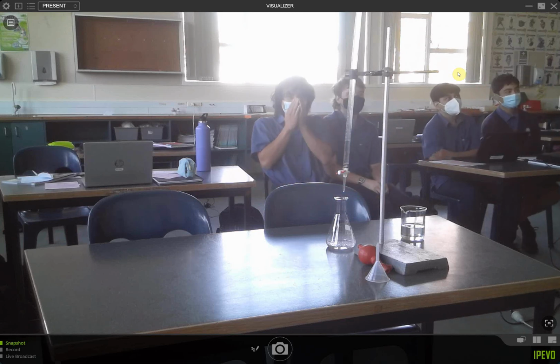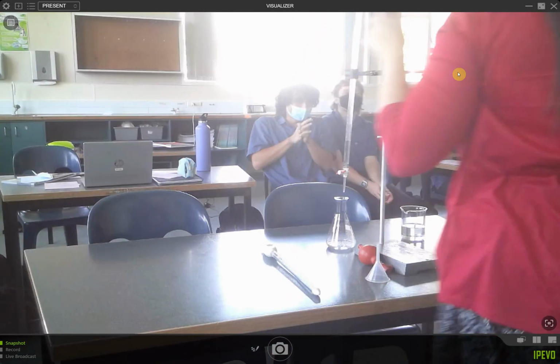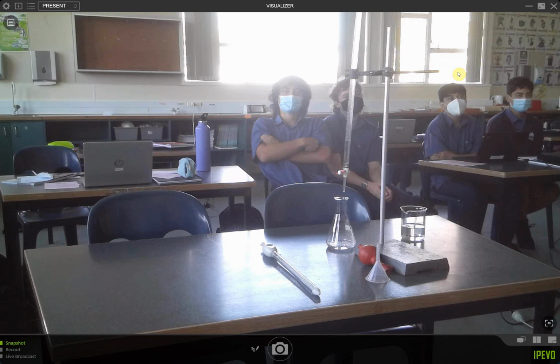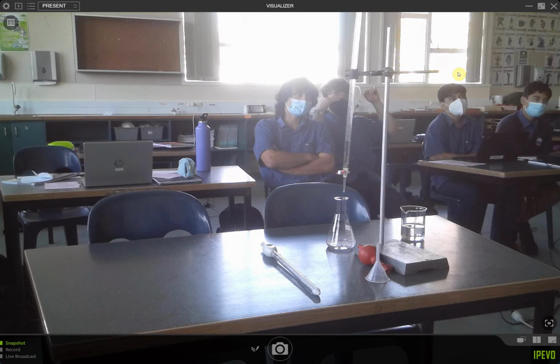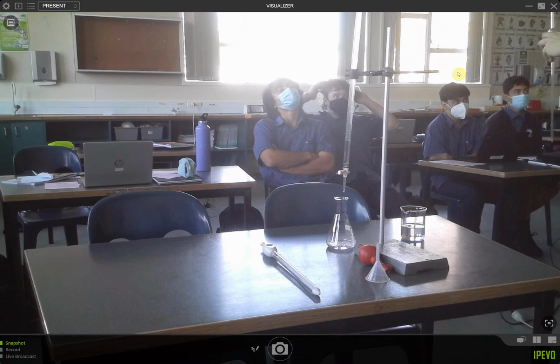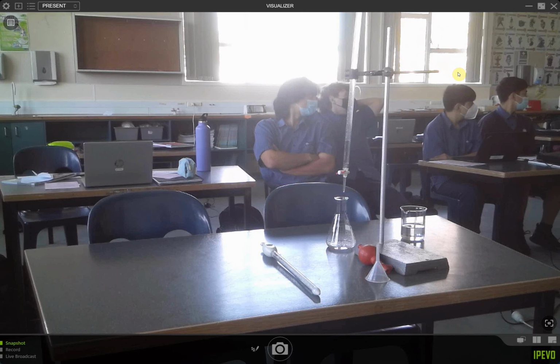You know how I was talking about the pipettes that you were using? These are also known as pipettes. The whole thing about these pipettes is that they're meant to measure and aliquot, so to give a set volume of liquid. Aliquot is just a fancy way of saying a chunk of liquid, so you're allocating it. When you're writing a method, you can call them both pipettes.